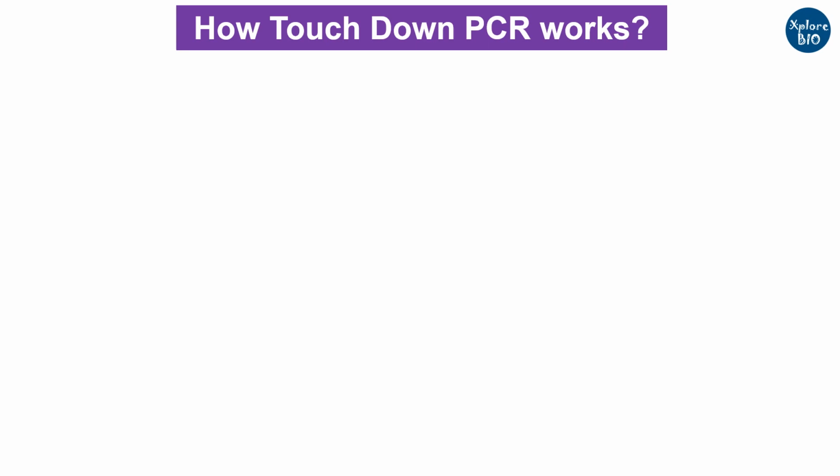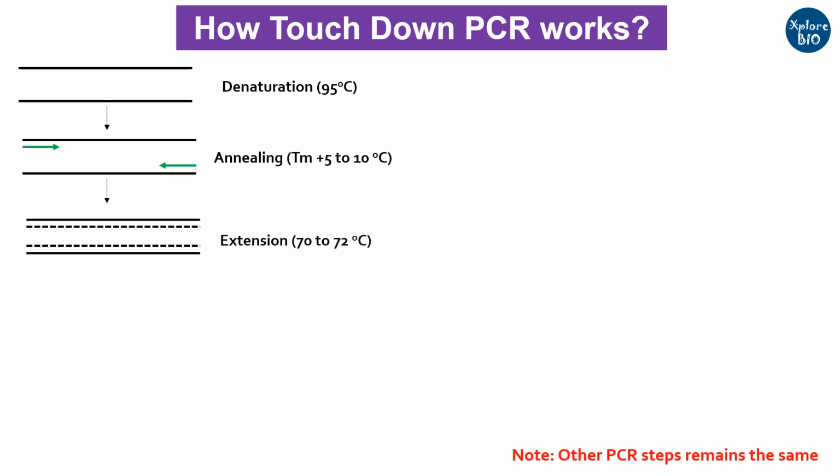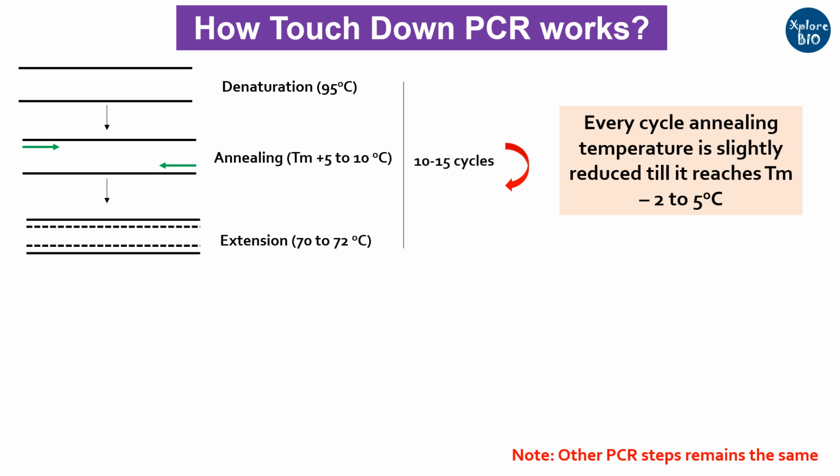In touchdown PCR, you initially set the primer annealing temperature at 5 or 10 degrees higher than the melting temperature or TM. At higher temperature, only very specific or highly complementary DNA will pair with each other. With each subsequent cycle, you lower down the annealing temperature by a fraction of a degree till you reach closer to the melting temperature. Thus, you perform 10 to 15 cycles at annealing temperature more than the TM. This way, you increase the PCR stringency and get much more copies of a specific target to be accumulated, and only very few non-specific amplicons would be there, even if any.